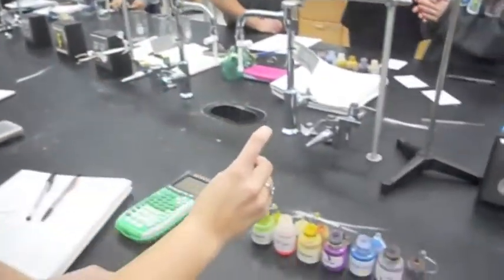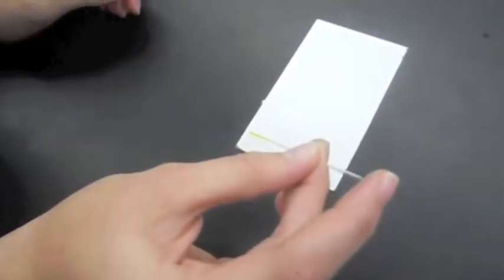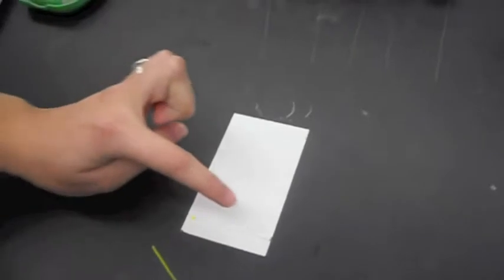In spotting a plate in paper chromatography, you take the capillary tube, place it inside the ink that you want to transfer, and you dot it on your pencil line. Make sure it's a small dot, and they need to be evenly spaced far apart on your 1 centimeter pencil line.